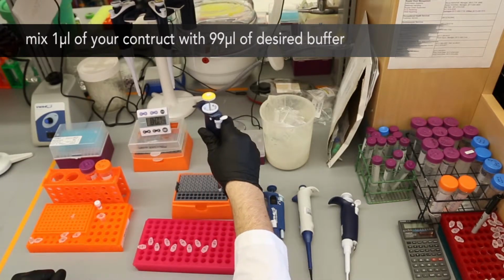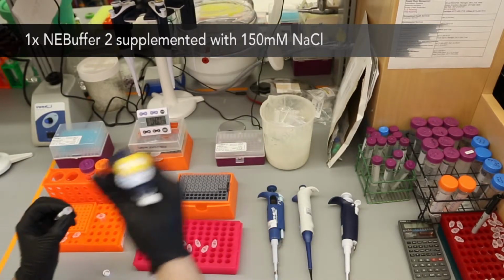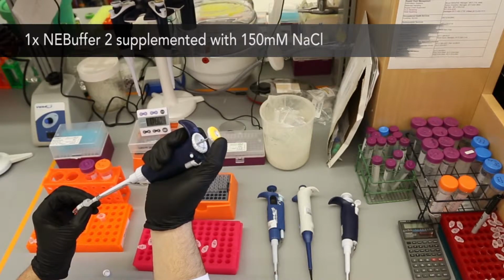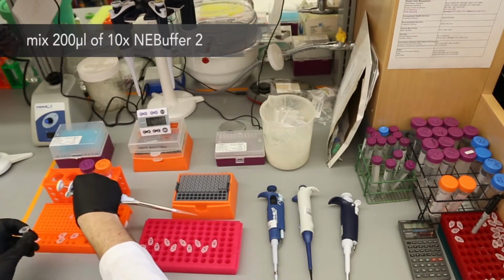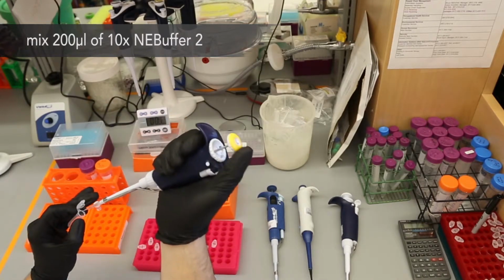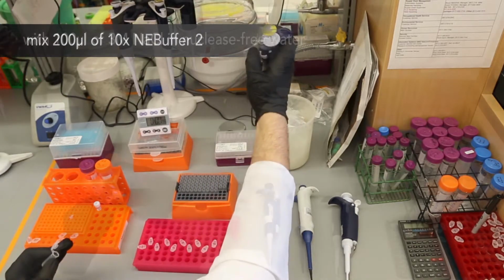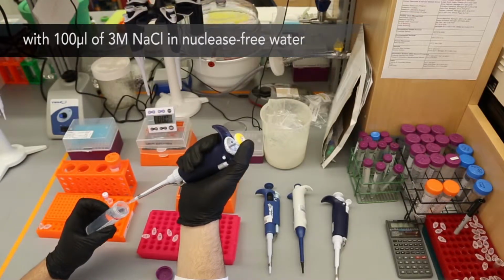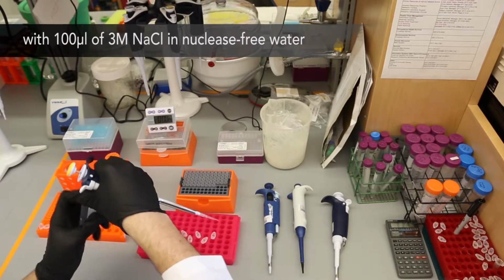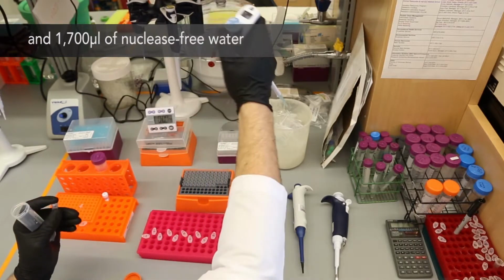One buffer condition that we recommend for the biotin streptavidin experiment is 1x NEBuffer 2, supplemented with an additional 150 millimolar sodium chloride. To make 2 mL of this, mix the following: 200 microliters of 10x NEBuffer 2, 100 microliters of 3 molar sodium chloride in nuclease-free water, and 1,700 microliters of nuclease-free water.